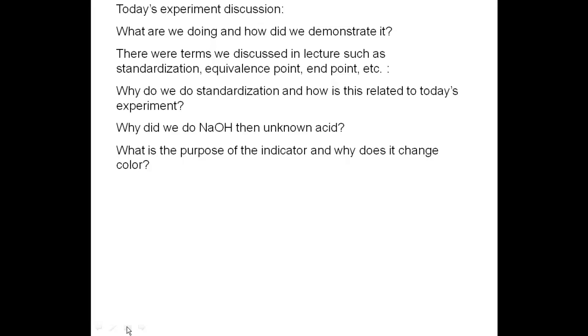There were terms we discussed in the lecture. Anything I give you in a lecture, you should be trying to put back in the discussion somehow, related to the experiment. There were terms we discussed in lectures such as standardization, equivalence point, endpoint. How are they related? How did you see those in this experiment? Why do we do standardization, and how is it related to today's experiment?